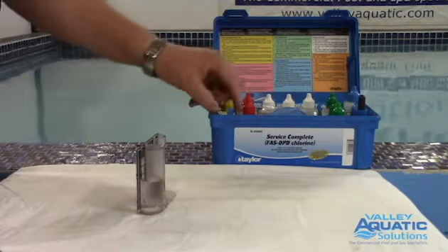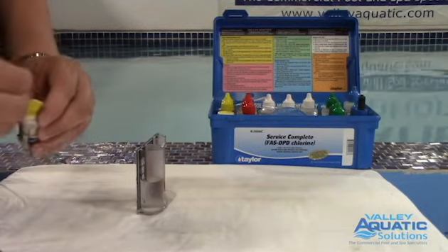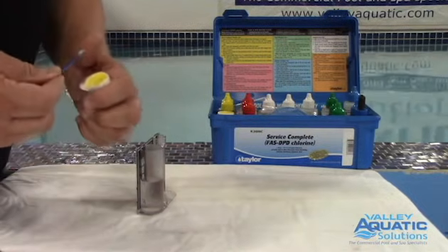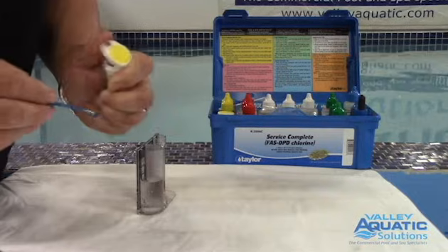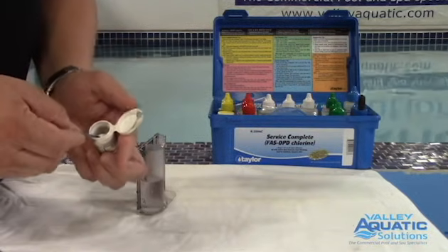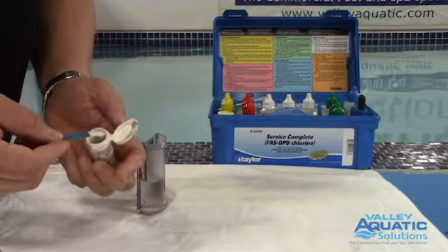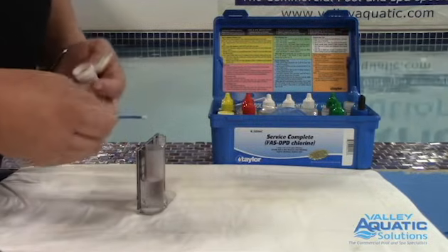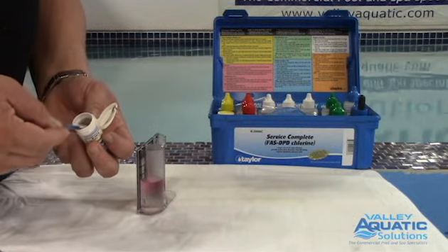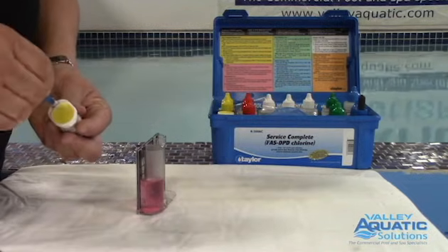Now I'm going to use powder R-0870. This is a used test kit, so the spoon has some powder on it. I thump it sometimes to get the buildup off — I don't wash it or get it wet; I want to keep it dry. The powder should be nice and white. If you leave the cap open and expose it to moisture, it'll turn gray. I'm tapping it until I have a nice level scoop — not leveling it off with my finger, just tapping it and getting it level. Two scoops turns pink in the presence of free chlorine. Seal that lid and put the spoon back in the test kit.